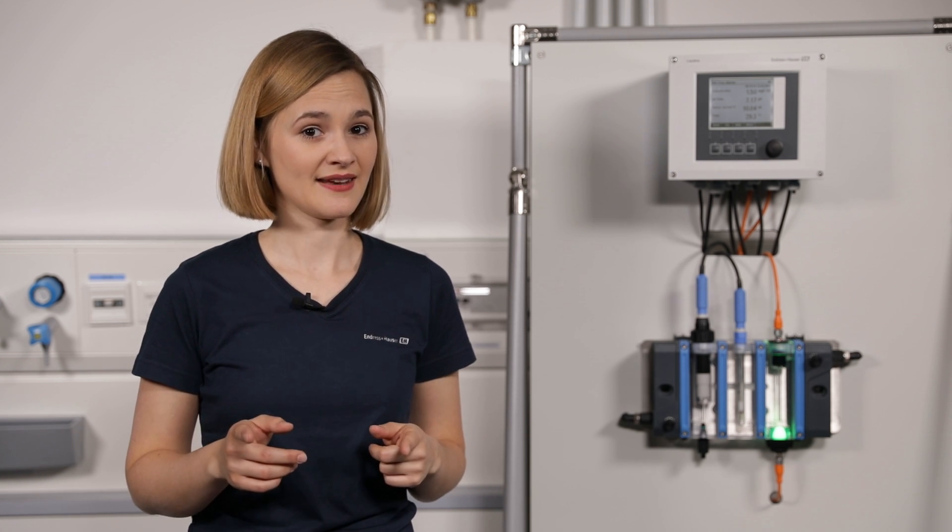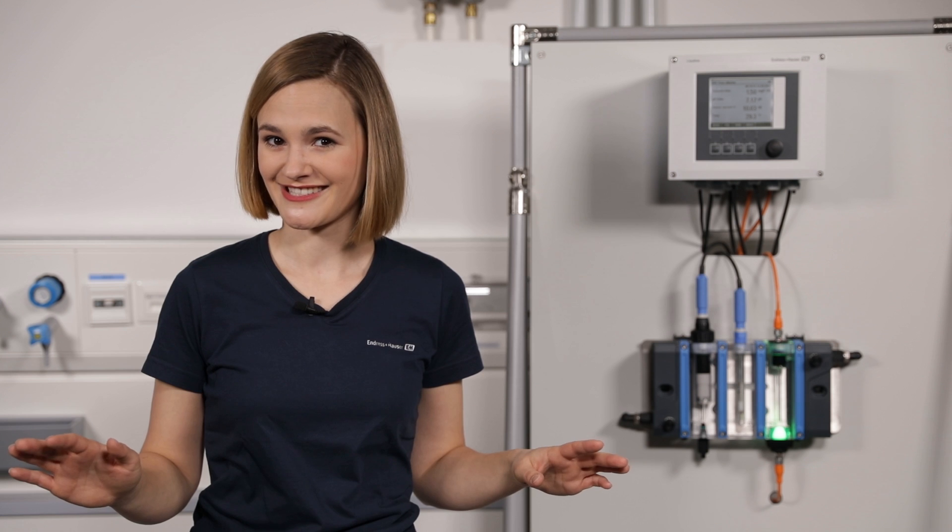I'm Teresa, the responsible service engineer for Endress+Hauser's disinfection products, and I will show you now how easy it is to perform the slope calibration and adjustment of the free chlorine sensor CCS51D. If you're aware of the following tricks, you're on the safe side — and you will see, DPD is not rocket science.